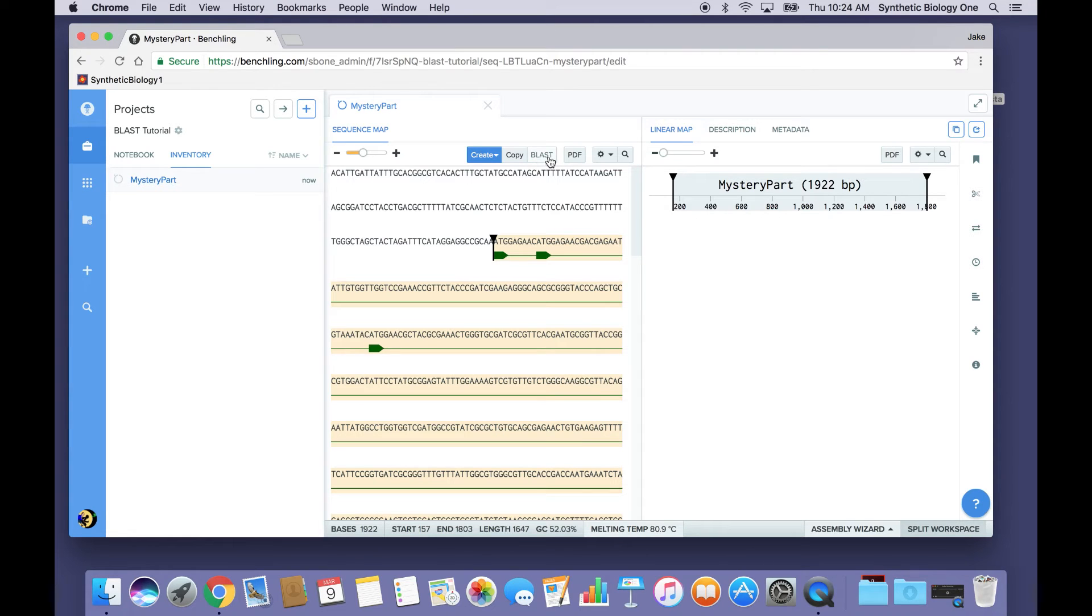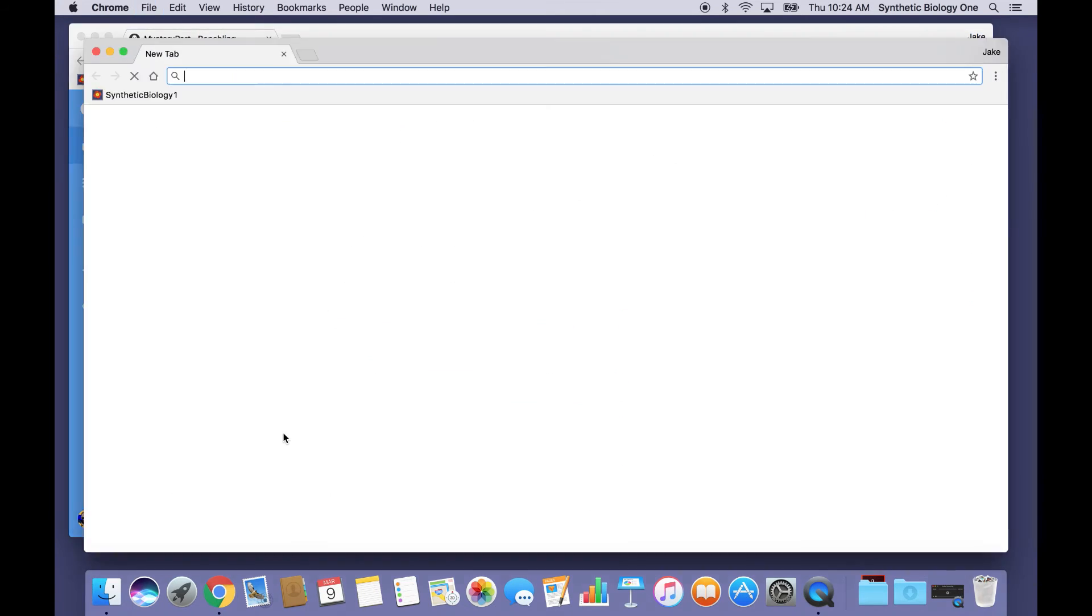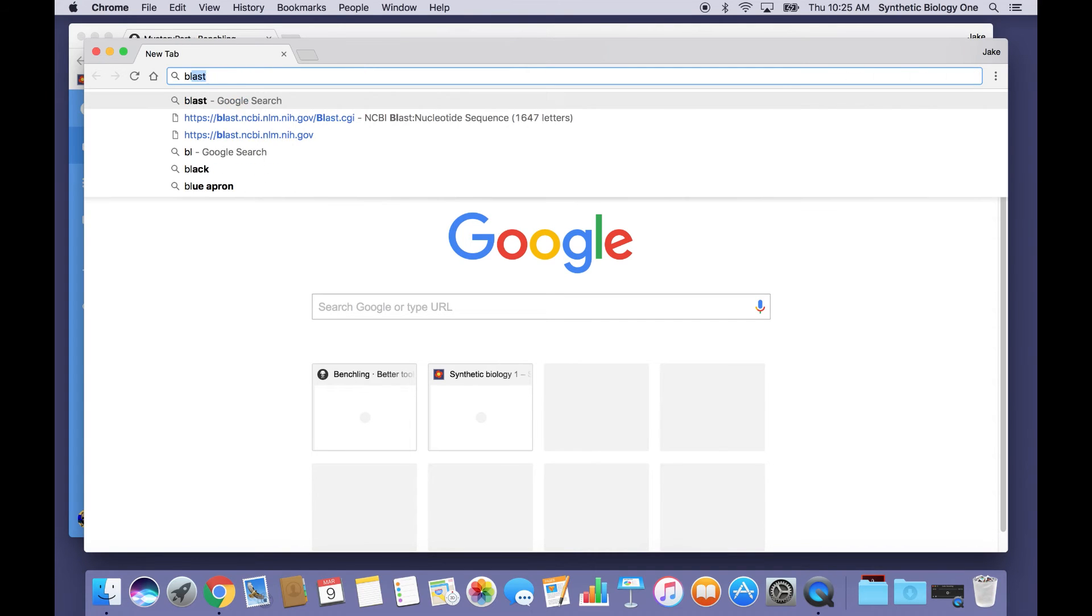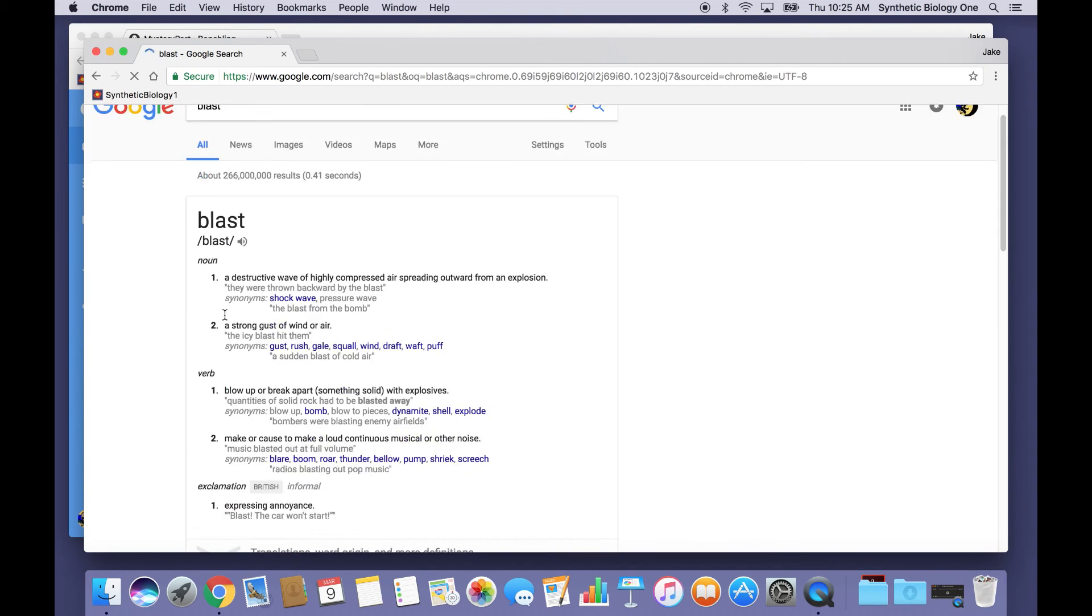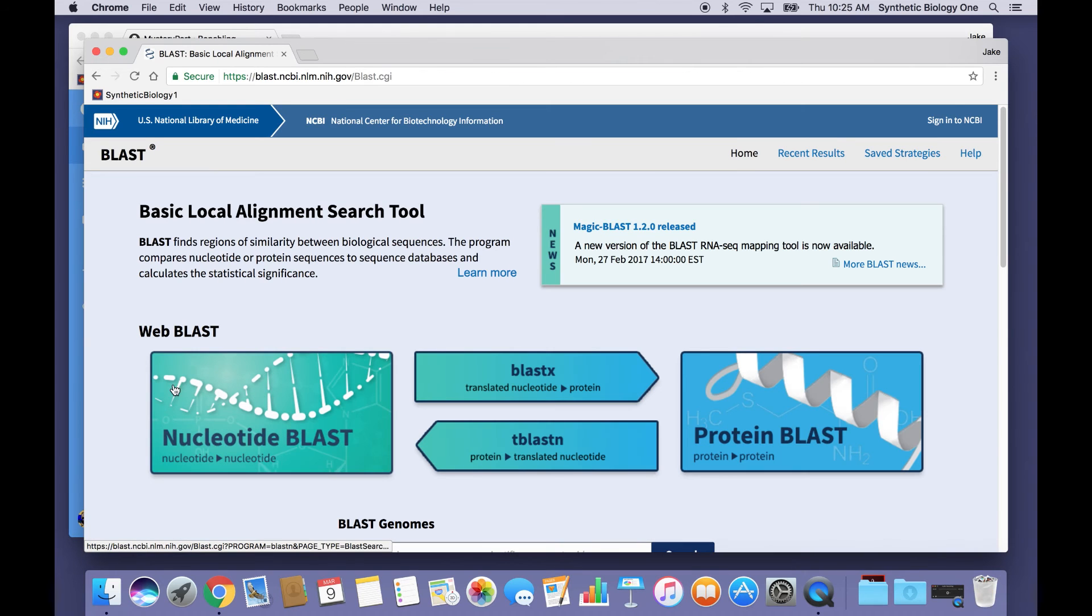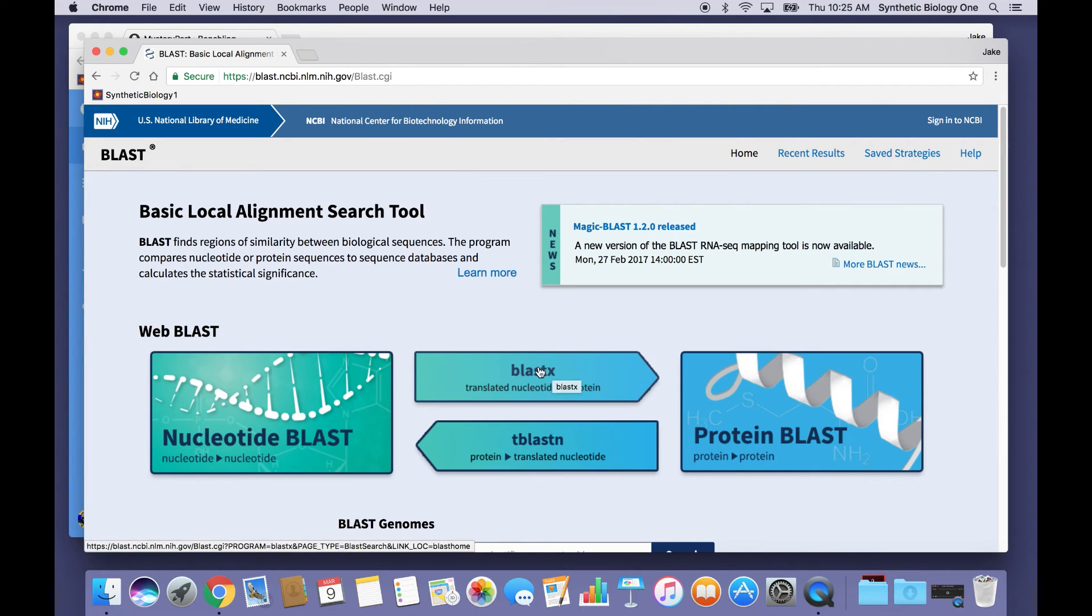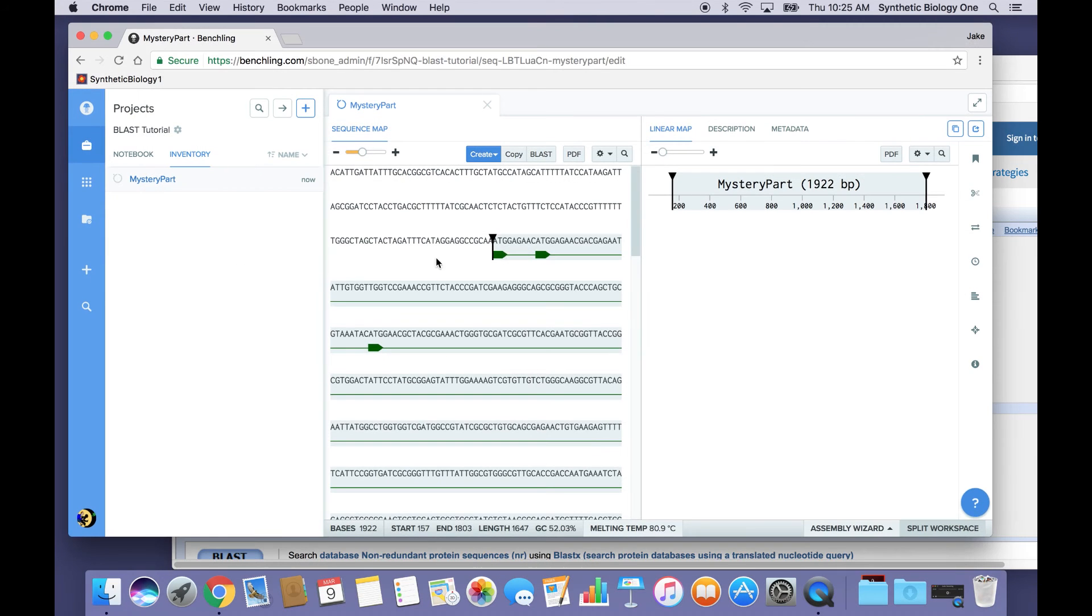So you might notice, sitting right here in Benchling, the BLAST option. So we can do this through the built-in Benchling feature, or just for teaching purposes, we can do it the old-fashioned way by Googling BLAST and going here to the NCBI BLAST database. So I am going to search for a protein. I'll choose this option. I'm going to search my translated nucleotides against their protein database.